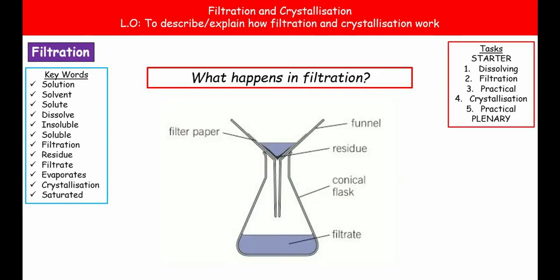The first process we're really going to look at then, and the first one of these separating techniques that you need to know, and not just the basics of it, but how it works, describe how to do the experiment, and what we'd use it for, is the process of filtration.